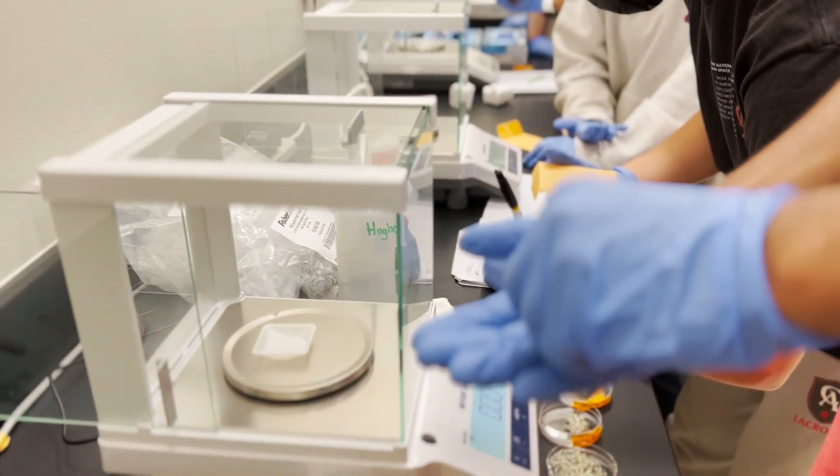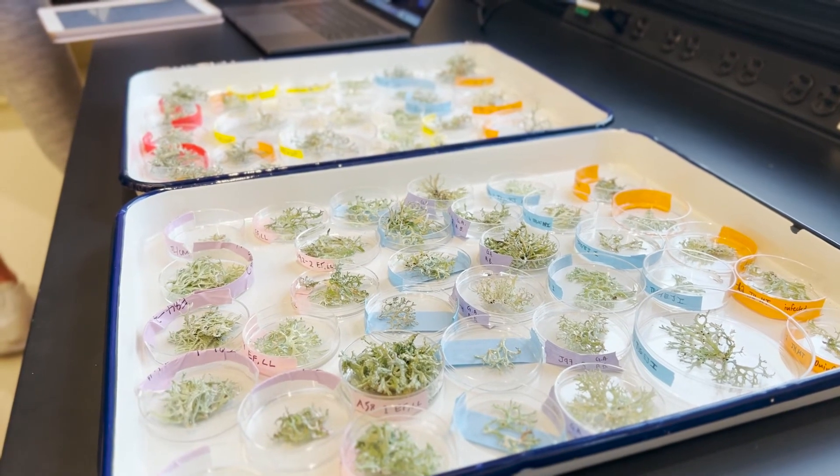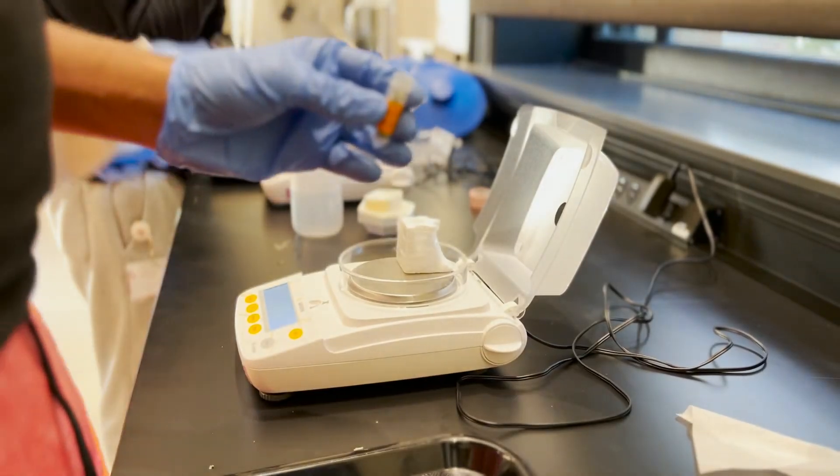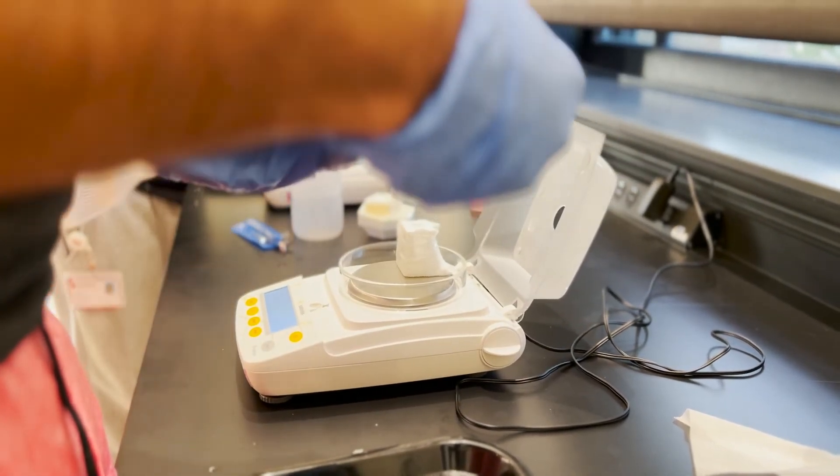Alright, just got out of lab week five. Today we took some of the lichens that we collected from Jasper Ridge and Rastradero. We weighed them out, put some of them in petri dishes to do some growth experiments, and put some of them in test tubes which will be sent somewhere for sequencing.